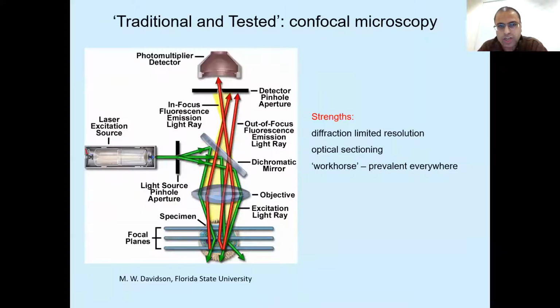And you can contrast that to a confocal microscope, which is the other extreme, right? In a confocal microscope, you have a laser beam. Typically, you overfill the back aperture of an objective lens. You form a diffraction limited spot on your sample, and then you scan the spot relative to the sample while recording point-like on a point detector, like a photomultiplier tube.